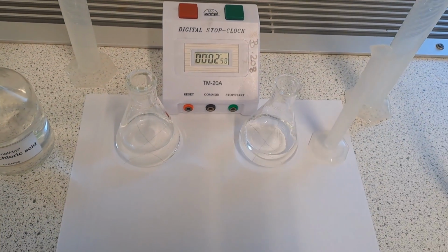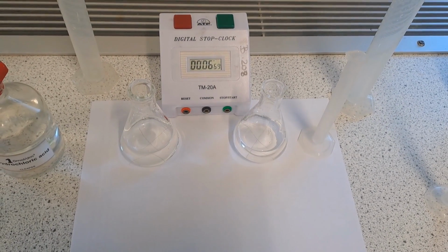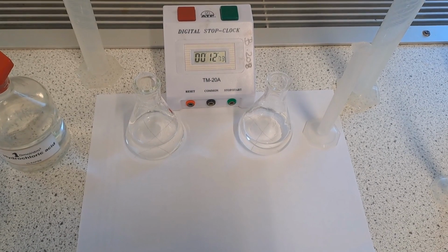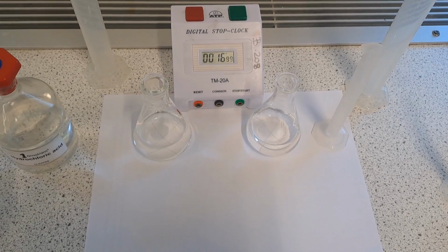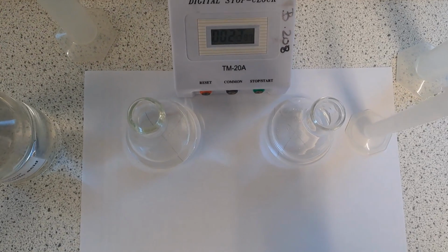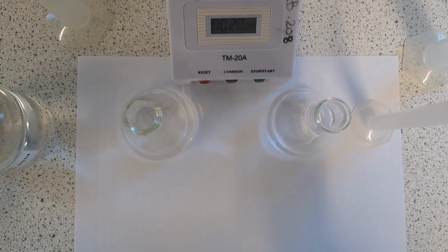So now that those have been added together, this reaction is going to start, and that solid sulfur precipitate that we talked about is going to be produced. And so because you're producing that solid sulfur within the aqueous solution, that's going to make the solution start to go turbid or start to go cloudy. And what I'm waiting for is the point where, looking down from on high, I can no longer see that cross that I've drawn on the piece of paper.